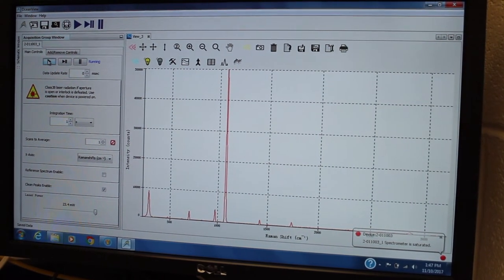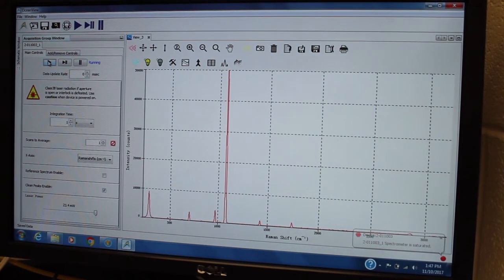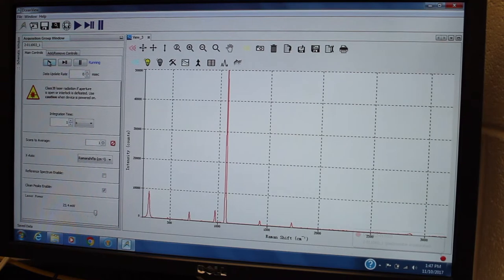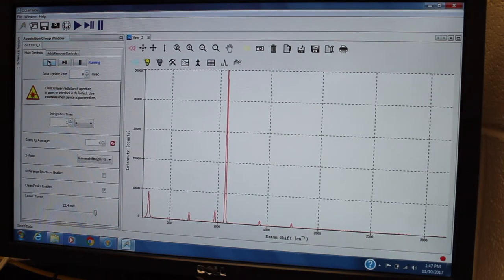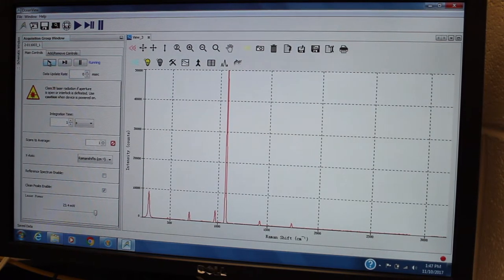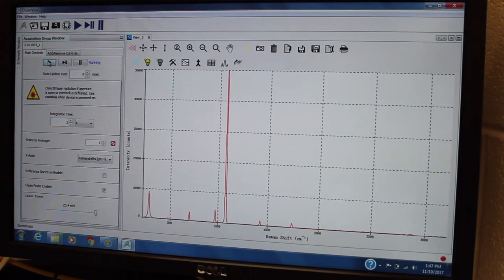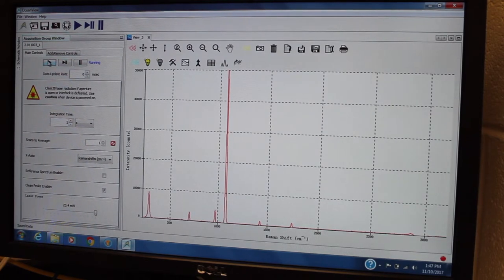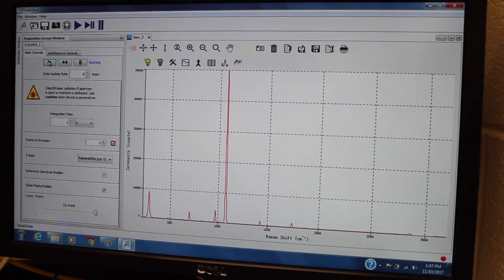So it's important if you're not getting a spectrum to go back and think about the steps and make sure that everything is in the right order and that you've done all the correct steps.